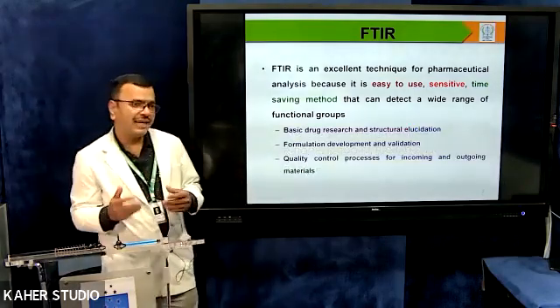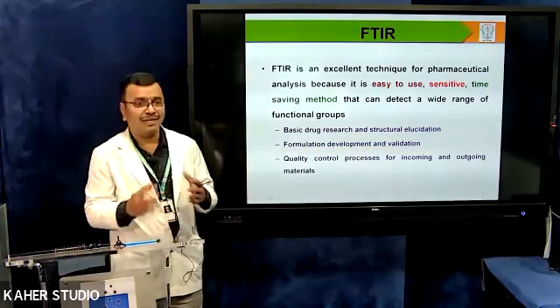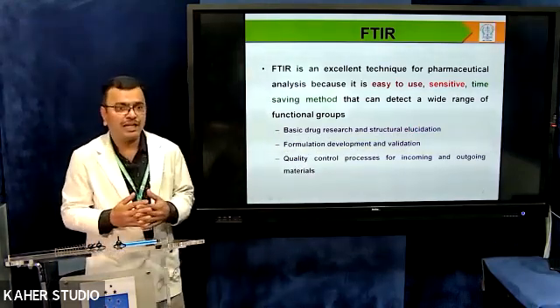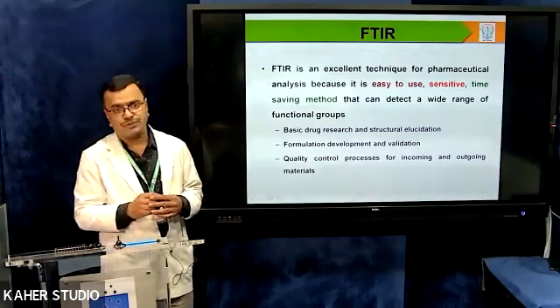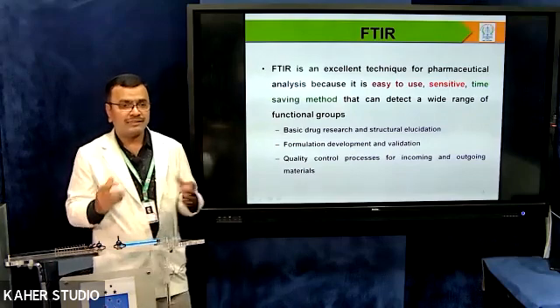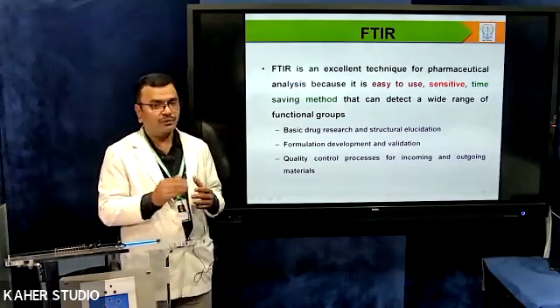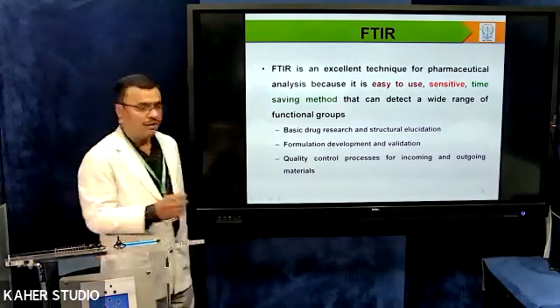And why has FTIR spectroscopy taken the lion's share in the pharmaceutical industry? Because FTIR gives a wide range of applications in basic drug research and structural elucidation of pharmaceutical and organic compounds. The second one is formulation development and validation technique. Third one is quality control, the process for incoming and outgoing material.